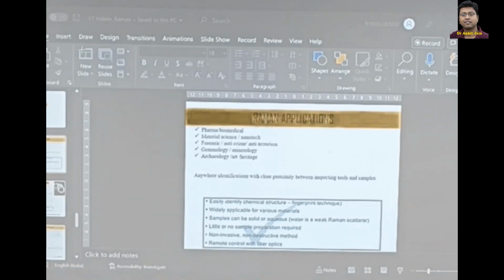Good morning, ma'am. I am Dr. Ankit Jain. There are different types of bacteria producing different types of enzymes in the laboratory, and some of these enzymes are thermolabile, some are thermostable at higher temperature. During this presentation you did not focus on that. Temperature is very important for a particular enzyme. So how can we detect different enzymes at different temperatures with the help of Raman spectroscopy?